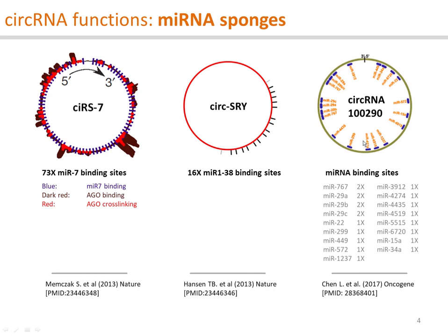Here is another example by one of our customers showing this circular RNA having many microRNA binding sites.